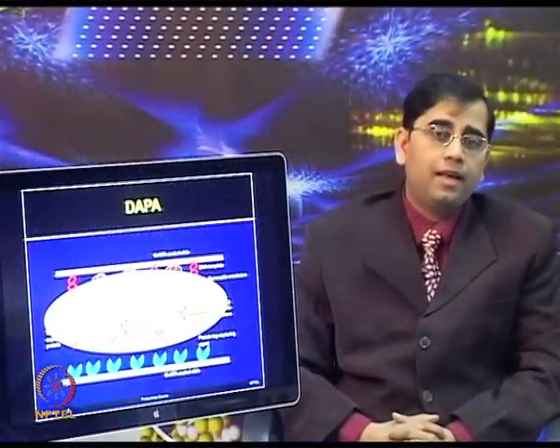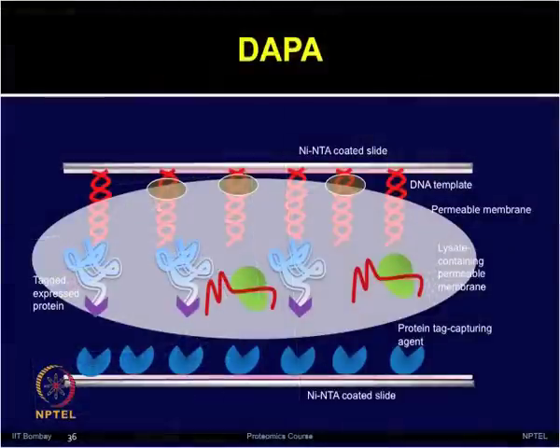So, as you can see in this slide, in DAPA the PCR amplified DNA fragments encoding the tagged proteins are immobilized onto a nickel NTA coated slide and assembled face to face with another nickel NTA slide containing the protein tag capturing agent.